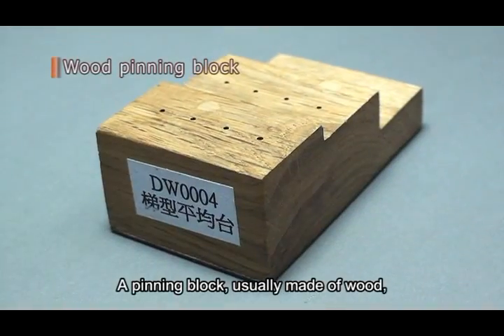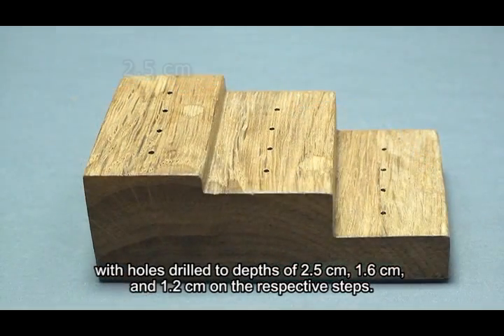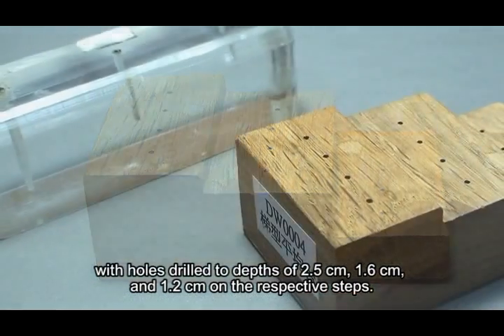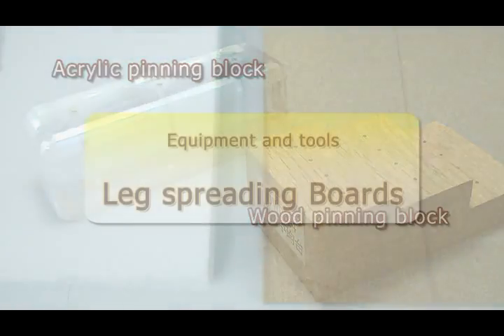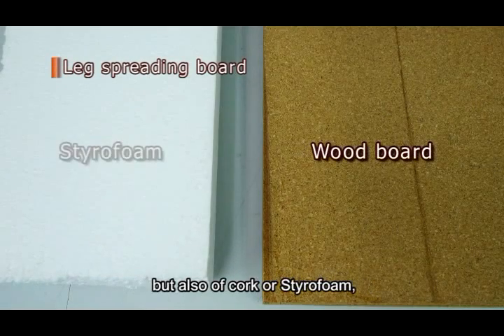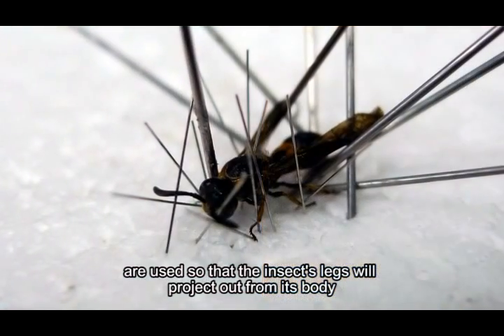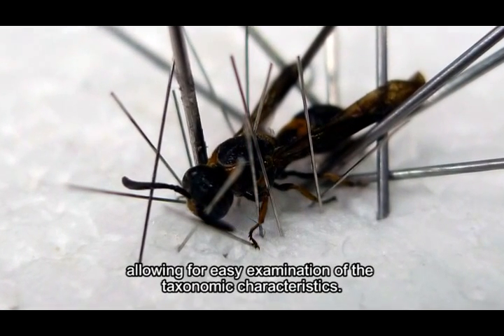A pinning block, usually made of wood, is shaped like a three-step stair with holes drilled to depths of 2.5 cm, 1.6 cm, and 1.2 cm on the respective steps. Acrylic pinning blocks with similar function are now also available. Leg spreading boards, which are generally made of wood but also of cork or styrofoam, are used so that the insect's legs project out from its body, allowing for easy examination of taxonomic characteristics.